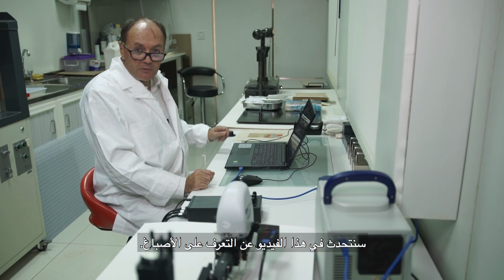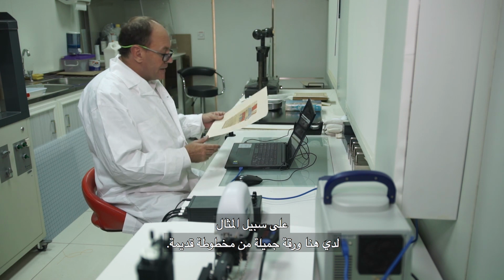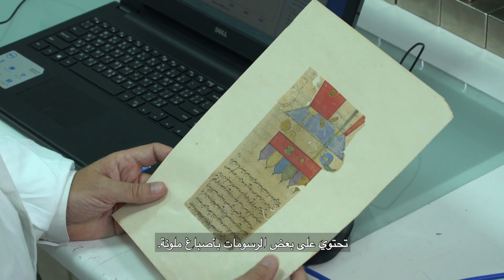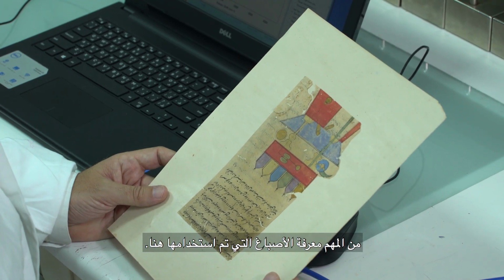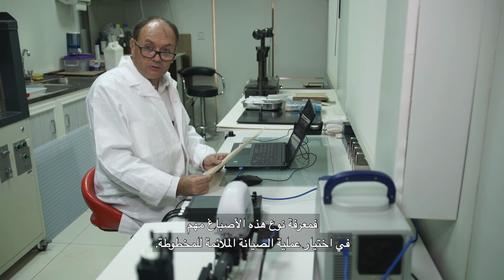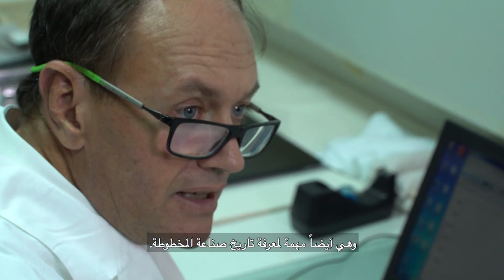We are going now to speak about identification of pigments. For example, I have here a nice piece of a manuscript which has some drawings with color pigments. It's important for us to know which pigment has been used. It has implications for the choice of the conservation treatments, but it's also important to know better for the history of the making of this manuscript.